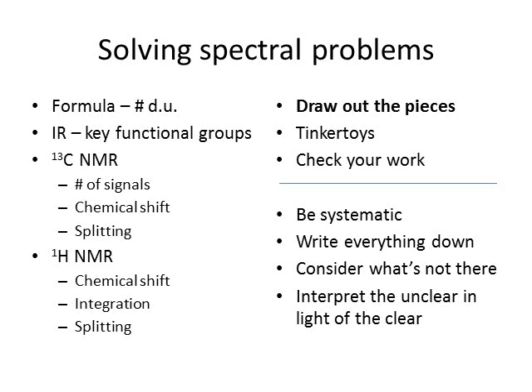If I had the proton NMR, I'd look at chemical shift, which tells me about bonding, integration, which tells me about how many hydrogens each signal represents, and splitting, which tells me how many hydrogens are next door to the hydrogen represented by that signal. These different spectra all tell me about the same molecule. And so today we're just going to focus on hydrogen NMR. But then at a later point, we're going to go back and put it all together and do problems where we've got some of each of these things.